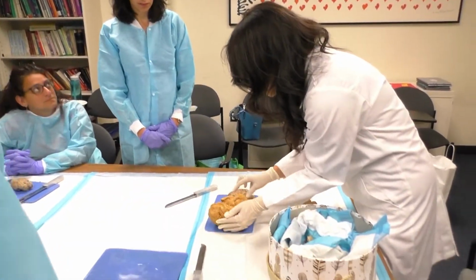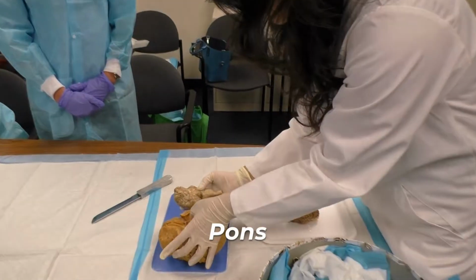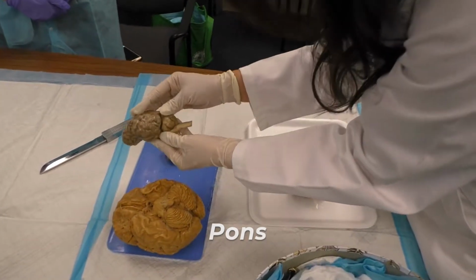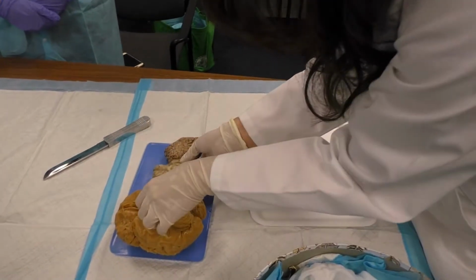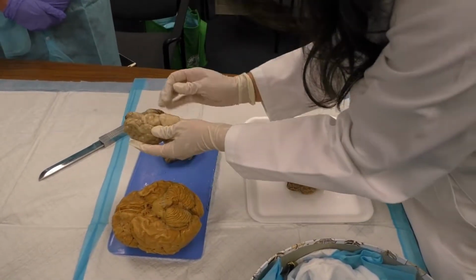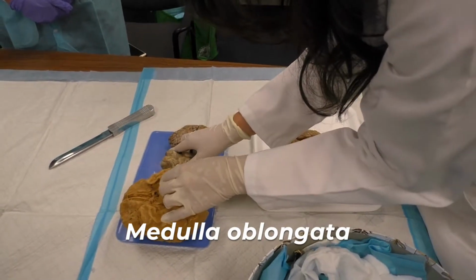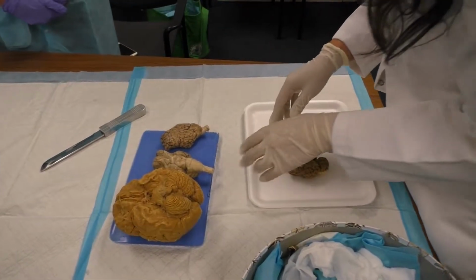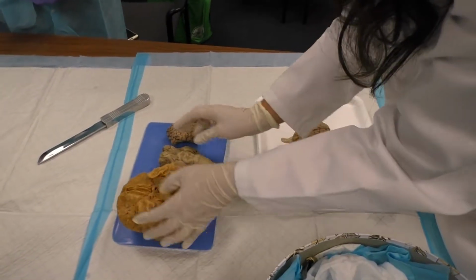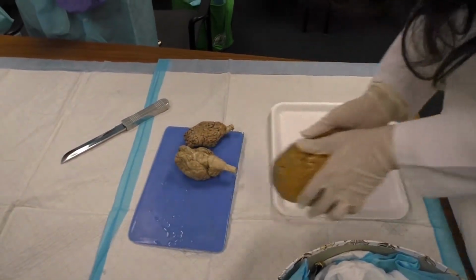Oh, and then, sorry, let me just go through a few more of these. So this is the pons. The pons is the structure right opposite to the cerebellum. A lot of the fibers from the cerebellum are going through the pons. And down here is the medulla oblongata, where a lot of the cranial nerves have their origin cells in the medulla oblongata.